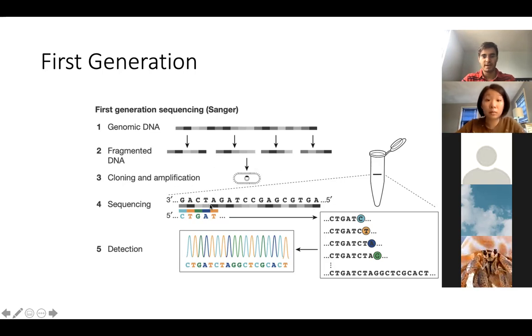So after that, we have the sequencing, which relies on DNA synthesis. There's another name for this, and I just forgot. DNA synthesis, the addition of nucleotides.